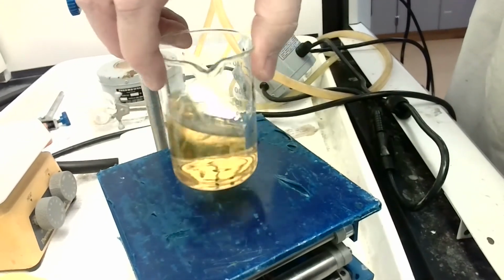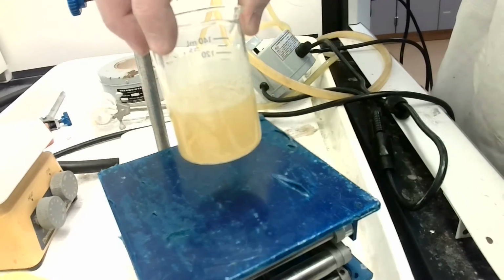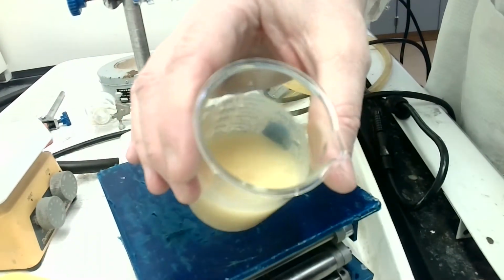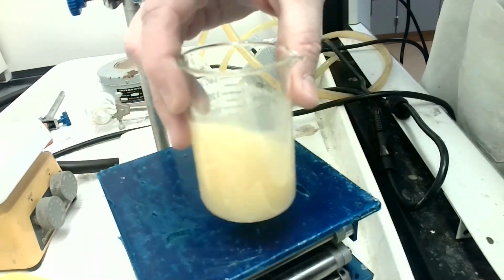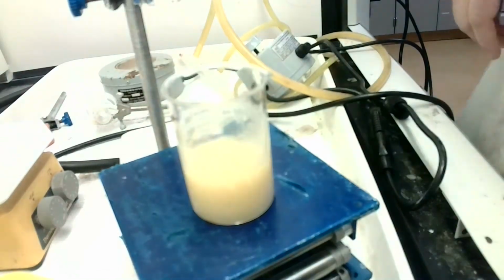This is water soluble. Oh, there it goes. Stir it really fast, yeah, and you got it. See now, it all crashed and precipitated. If you look inside, you'll see a nice precipitate. So I'm going to ice this for about 2 minutes and then do a crude filtration.